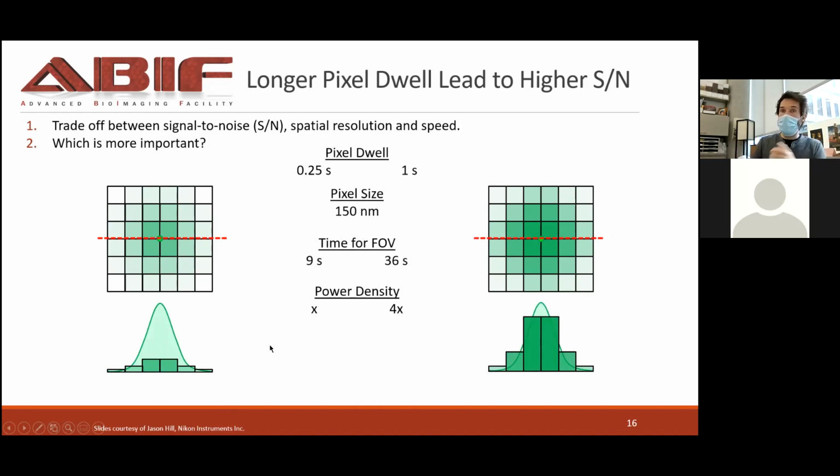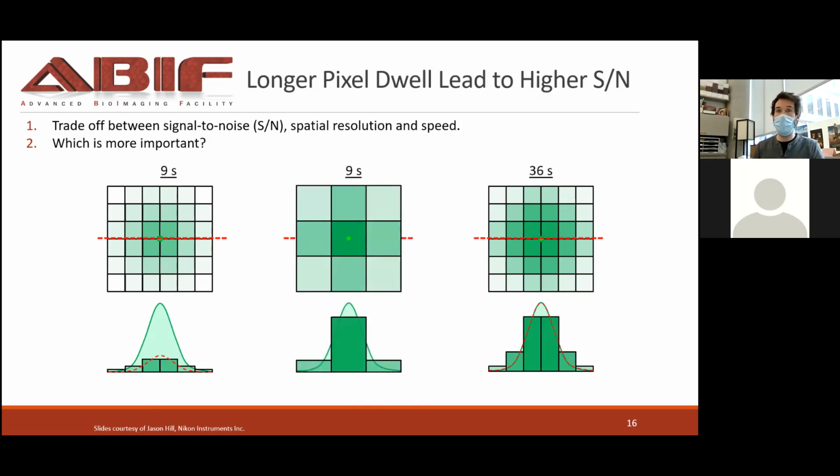So again, it's going to be a balance of exactly what you need to see within the time that you have to acquire it. And this is again compared to what we discussed earlier, which is just getting a lower sampling frequency. So here you kind of have this in between where it's faster but lower res. So all these things to balance, essentially.